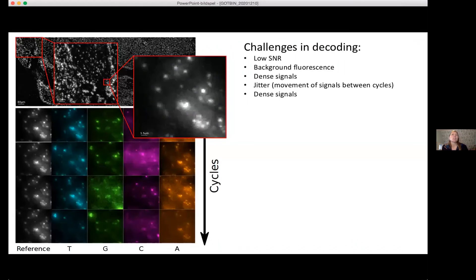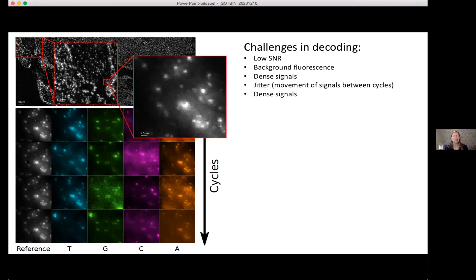I work with image analysis, and the first challenge with this type of data is decoding. Sometimes there is a low signal-to-noise ratio, background fluorescence, dense signals, and jitter or movement of signals between cycles. Depending on the protocol design, you may have a reference channel showing all rolling circle products, or only the output from different sequencing channels across rounds.